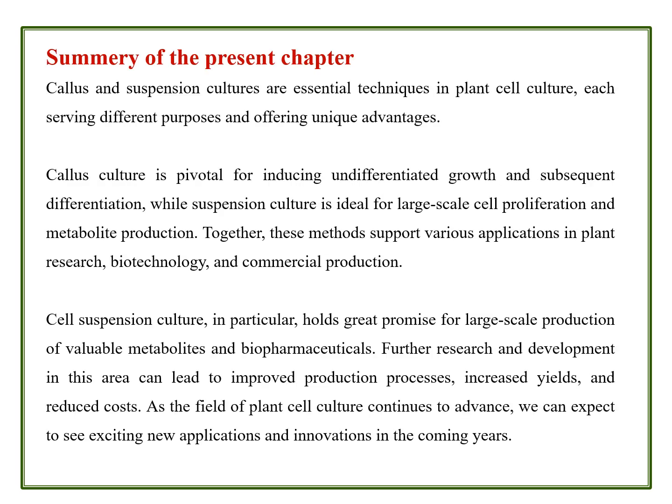Let us summarize the present chapter, that is callus culture and suspension culture. Callus culture is obtained from an unorganized group of cells on a defined media. Suspension culture can be obtained without agar on a defined media. Both are essential techniques in plant cell culture, each serving different purposes and offering unique advantages.